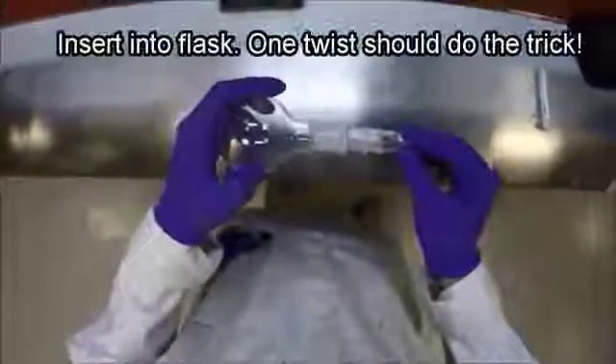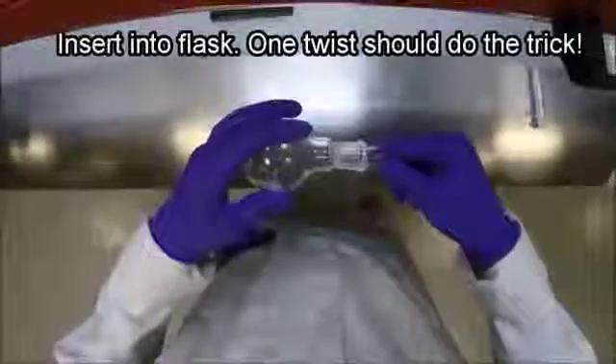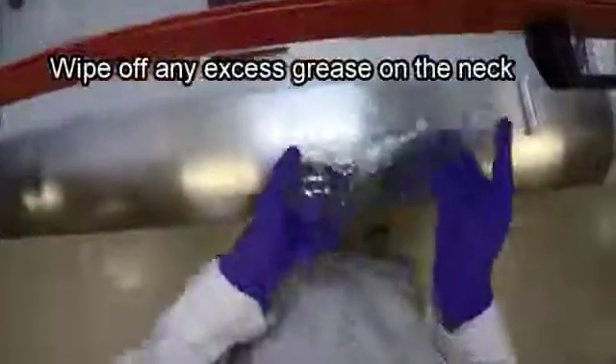Gently insert the tube into the flask and give it just one twist. That should be enough for it to seal completely. Notice how the top two thirds of the neck of the flask turn clear — that's what we're looking for.